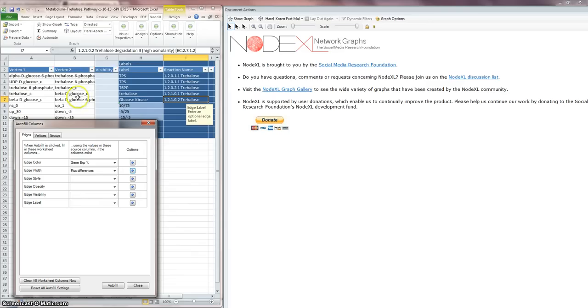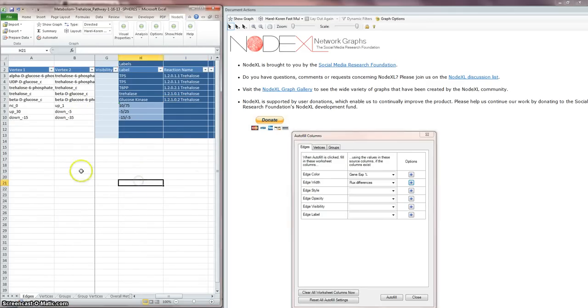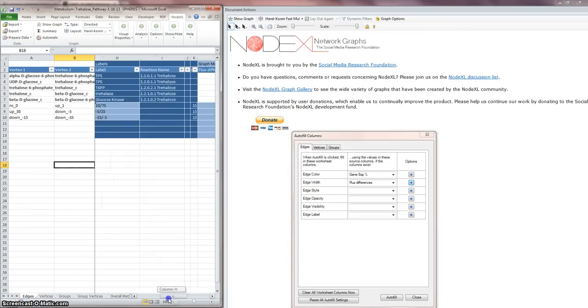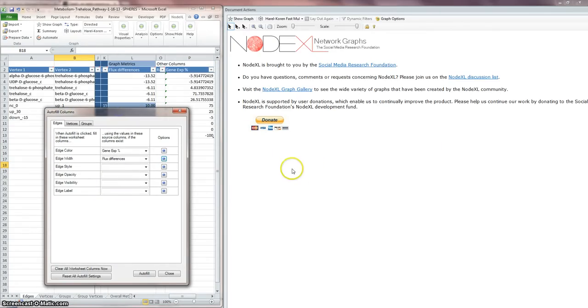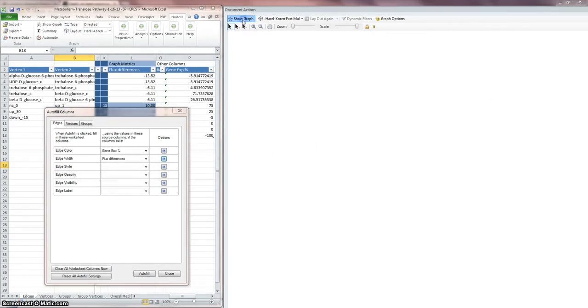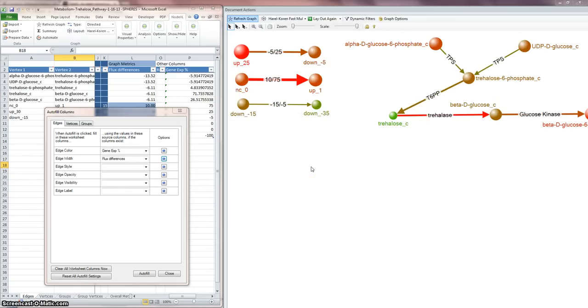Now what I like about this is you have your spreadsheet here very nicely. This floats in a window. You can go into your spreadsheet, do what you need to do. You just need to size it for your monitor. I have a pretty large monitor, and then you get to see what happens on the graph.